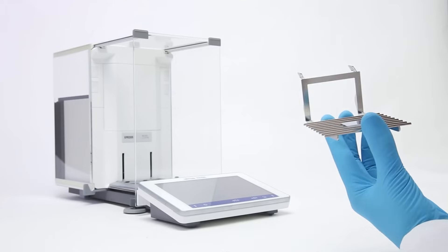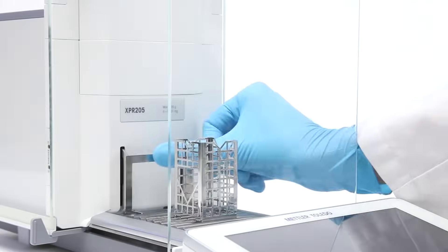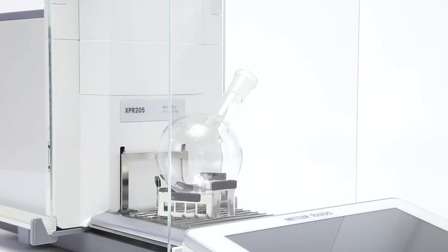On top, it allows clever use of accessories for an even more efficient process.